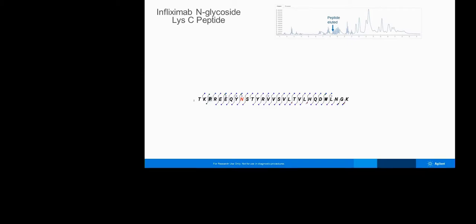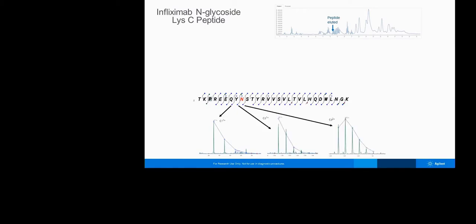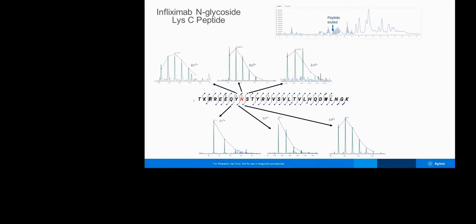So you can take your mouse and you can click on the different dots, and that will show the spectrum. So in this case, I'm going to start from the amino side, one residue before the N-glycan. And so you can see the C7 ion, the C8, the C9. Coming from the other side, you can see the spectrum as you walk in. So you're getting identifications with fragments on both sides of the chain. So you have a very high degree of confidence of what this is.